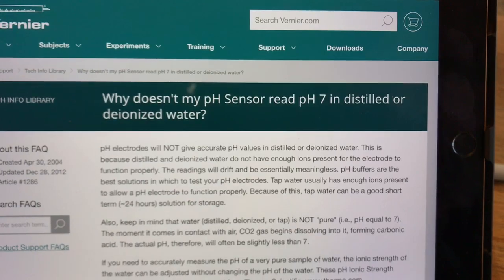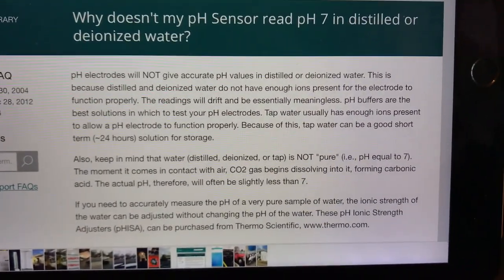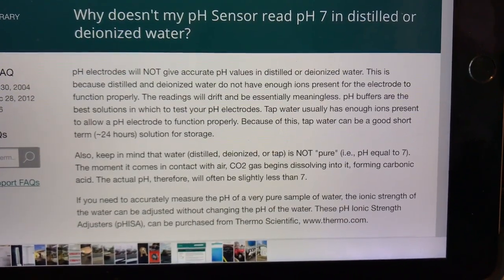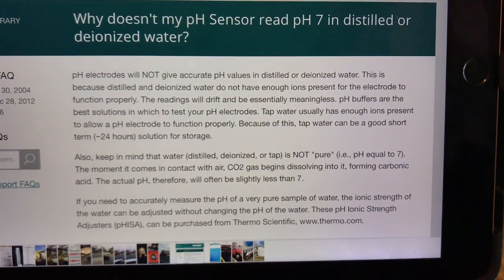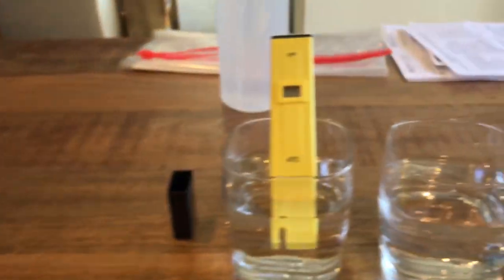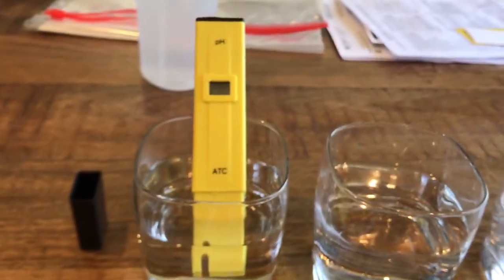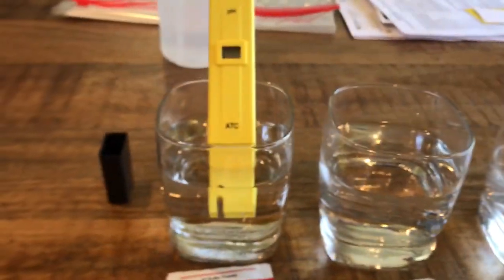The article is titled 'Why doesn't my pH sensor read 7 in distilled or deionized water?' It says pH electrodes will not give accurate pH values in distilled or deionized water — something to do with the ions. So what I'm getting here is: don't try to use distilled water to calibrate your meter, because it doesn't work. You can rinse it off with distilled water, but don't calibrate with it.